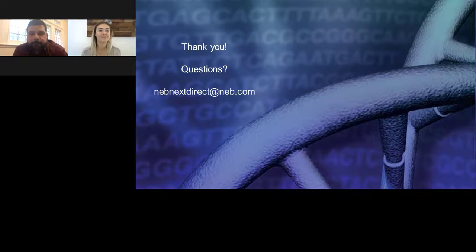Great. Our second question says, how many base pairs long should a UMI be? The length of a unique molecule index has to do with the operating size of the UMI. If we think about it very simply, it's a random sequence that gets appended to each of those molecules, so how long it is will impact the number of available UMIs. Some studies have shown that having a UMI greater than about 8 base pairs is useful. In our technology, NEBNext Direct, it's a 12 base pair UMI, so that ends up being 4 to the 12th, which is just under 17 million available. But most of what I've read recommends a UMI greater than about 8 base pairs long.